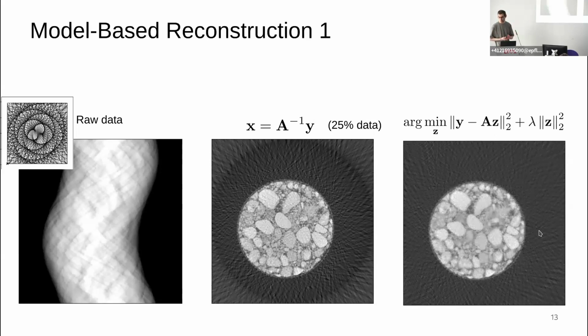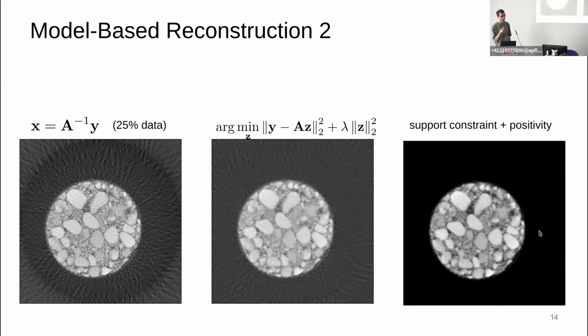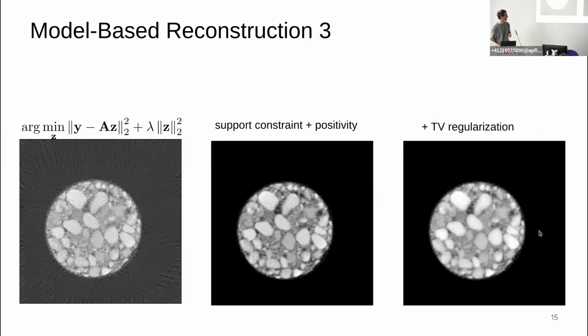And then you can use more regularized inversion methods by just saying, I know the image is in the center, the background is black, etc. And by doing so, again, by just adding a few lines of code and tweaking your optimization problem, you can get progressively better images. And then beyond this, you can add more, like total variation regularization. Whether it's better or worse is up to the scientists to decide, but basically we can do these types of image transformations very quickly. And everything I've just showed you was really one afternoon's work, which would take much longer in general.